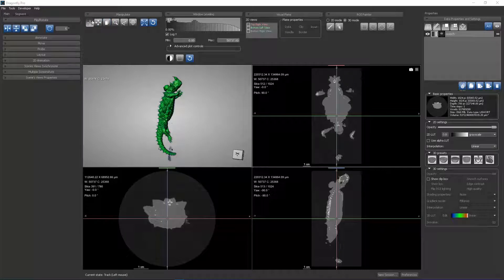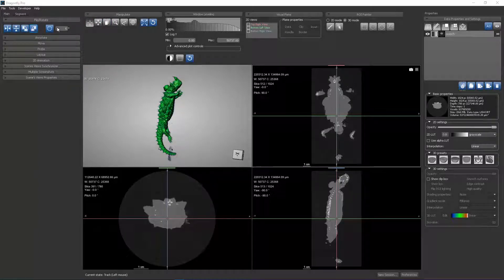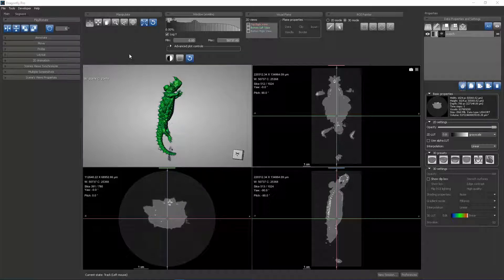The Manipulate control panel is usually found on the main tab. For my workspace, I've undocked it from the main tab and put it at the top of my user interface because I use it so often.